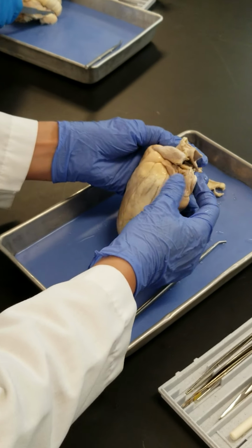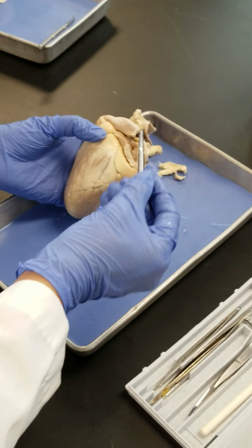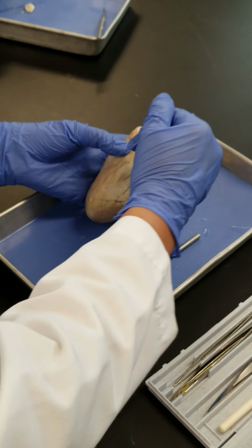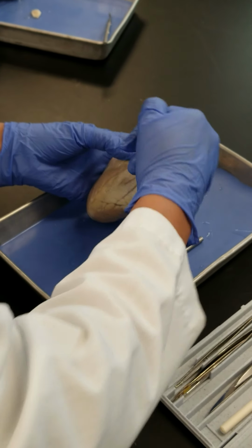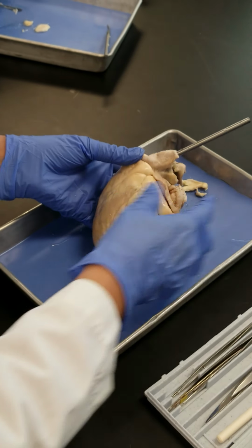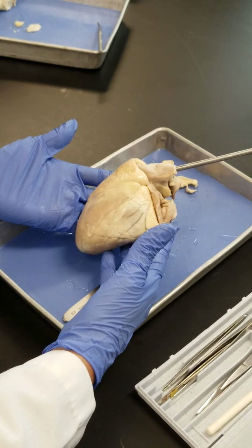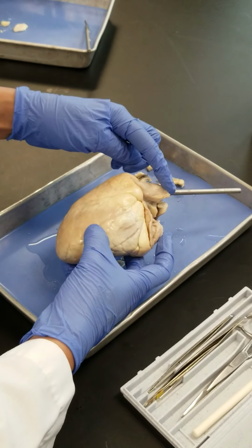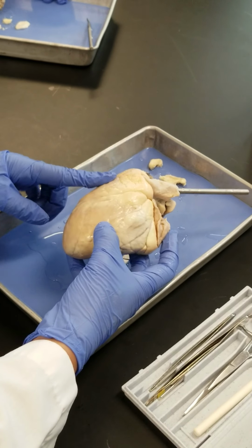Okay, this is better now, right? Now you see one vessel here. If you follow that simply by your finger or by the probe, whichever is easier. This one is kind of long, so I just use the probe here, right? And you can even see the direction of the vessel here, right? So this vessel is coming out of this chamber.